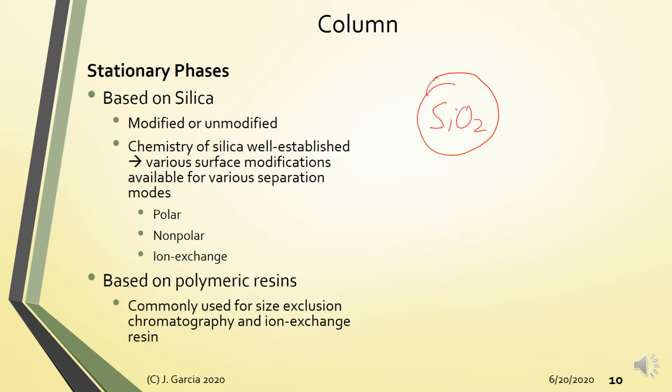Now the nature of the terminal SiO2 bonds, or yung chemical surface, would look something like this. Alright, so the terminal groups, which comprise the surface of your silica, contain what we call your silanol group. Now, this silanol group is, as you can see, analogous to your alcohol group. So, they are polar in nature. Alright? So, if you're going to use unmodified silica as stationary phase, then what you have there is a polar surface.